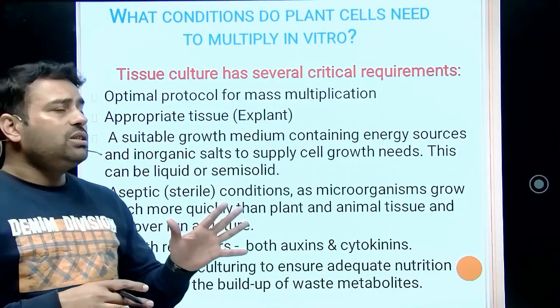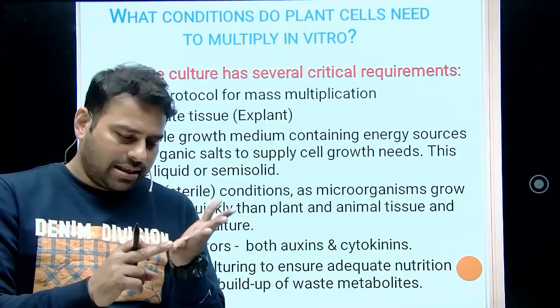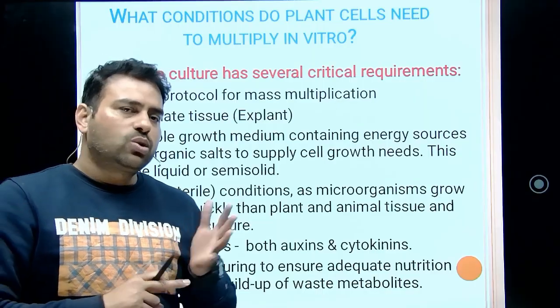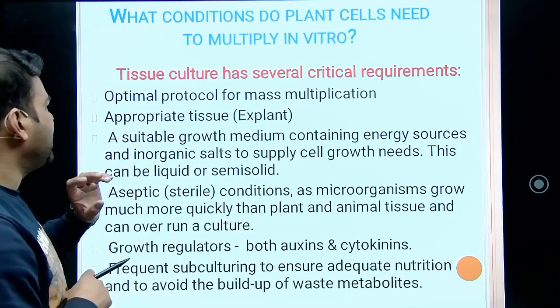So what conditions do plants need? What are the requirements? The basic requirements are, first, the explant, secondly, nutritional media, and third, aseptic culture conditions. One by one we will discuss these requirements in detail.